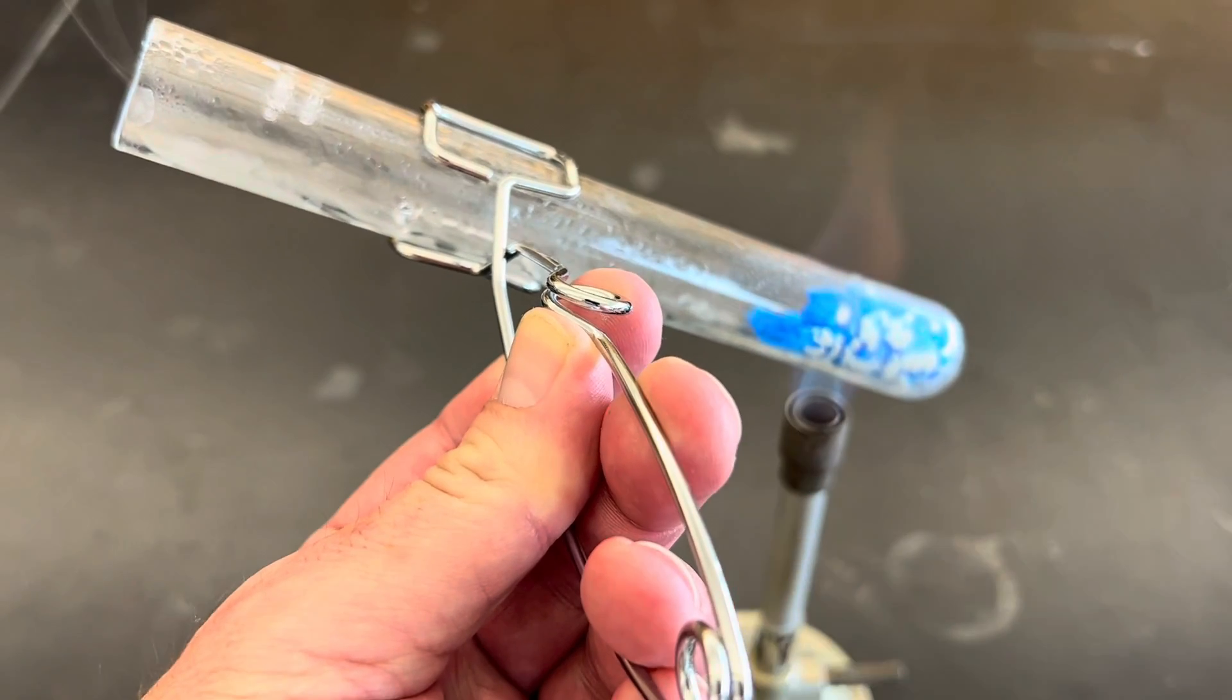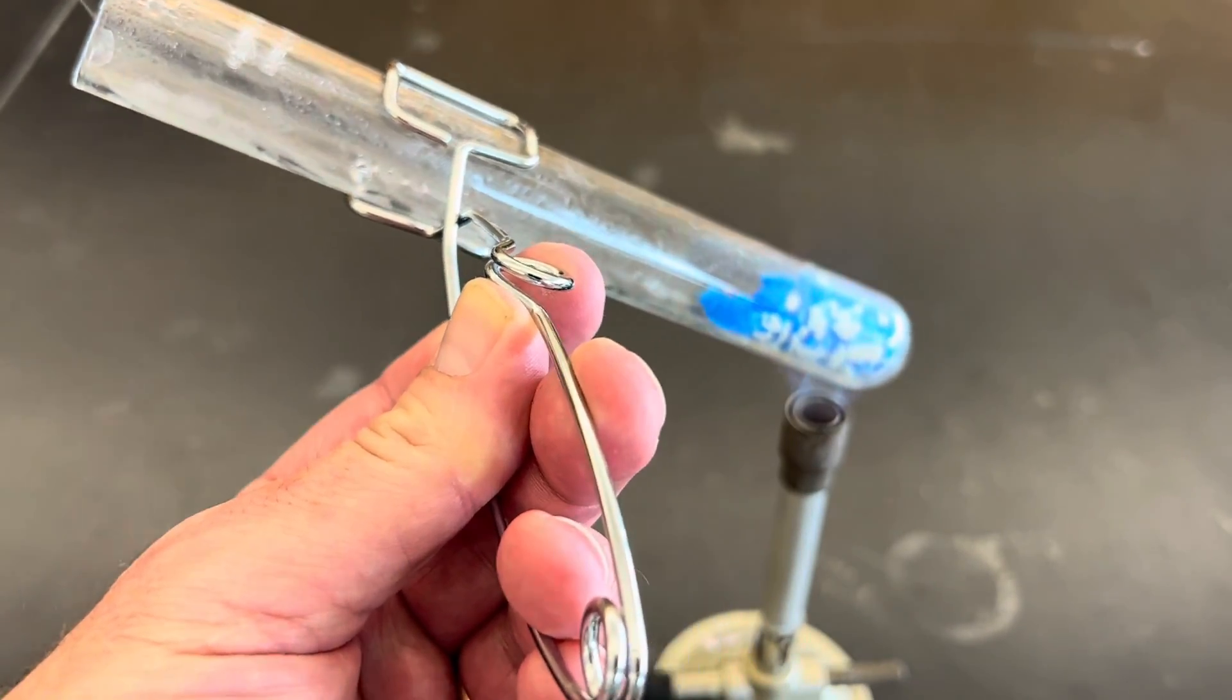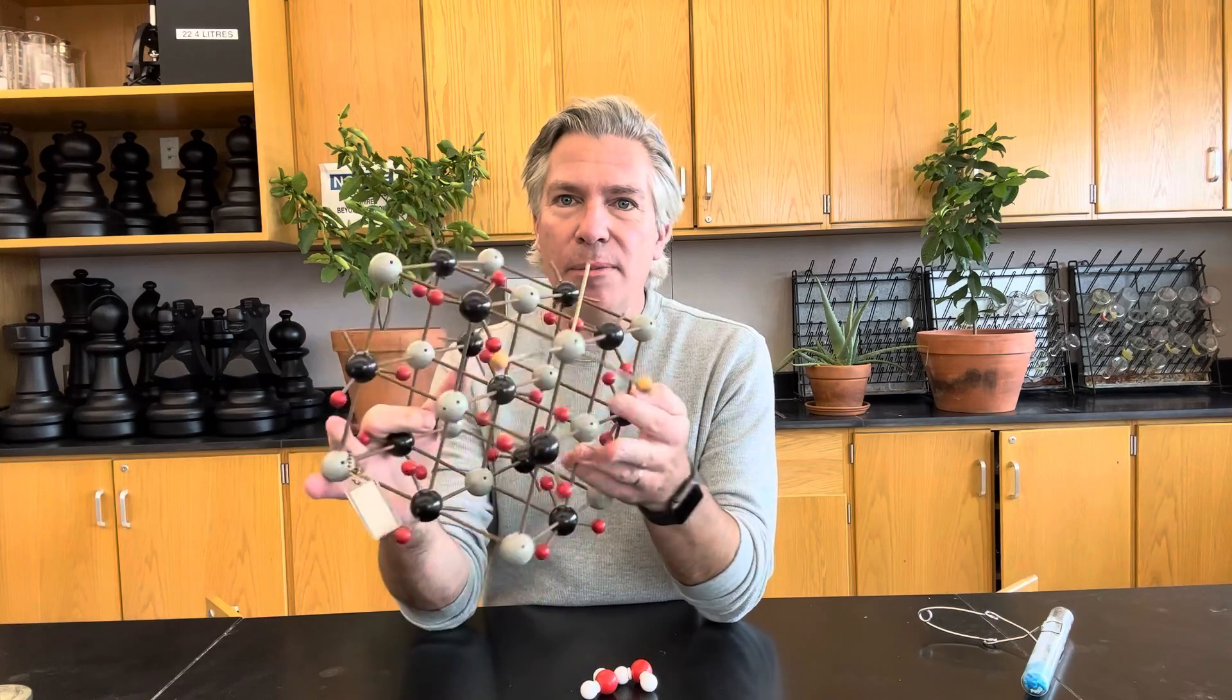And wow, there's some liquid in there. There's some condensation happening in the middle of the test tube. The only thing I added to my test tube was those crystals of copper(II) sulfate, but after I heated them I got all this condensation happening and some steam coming out the top. Where did that come from?